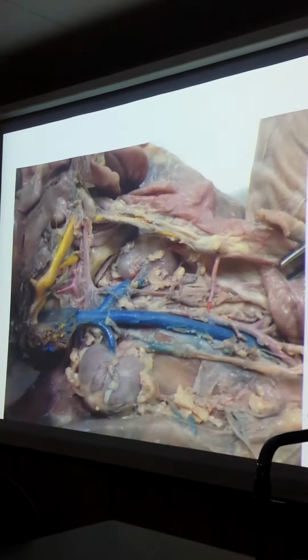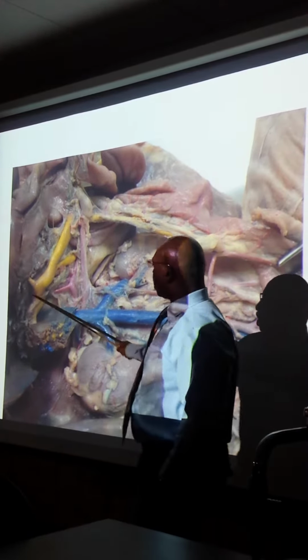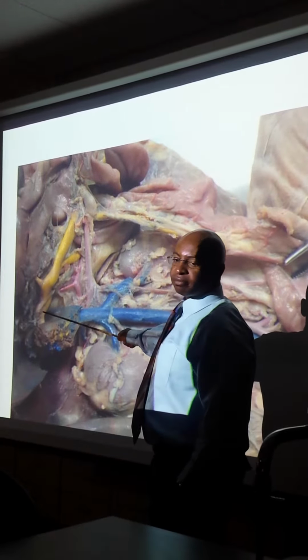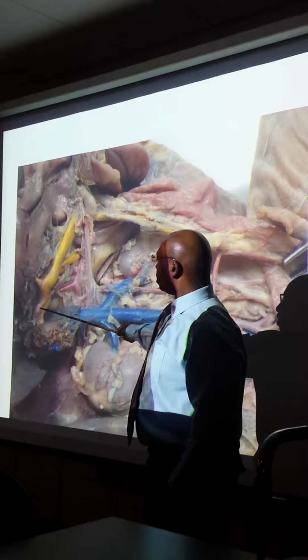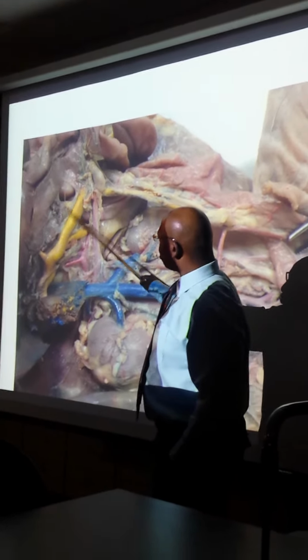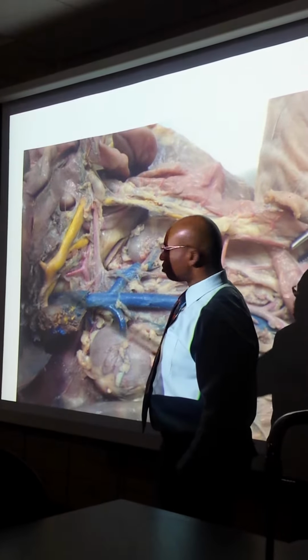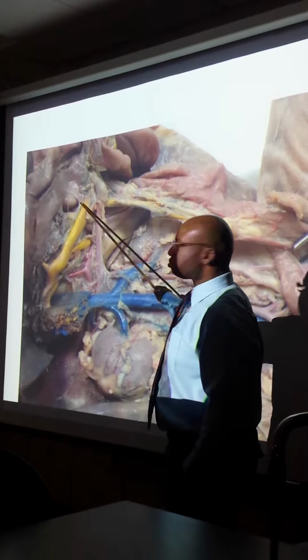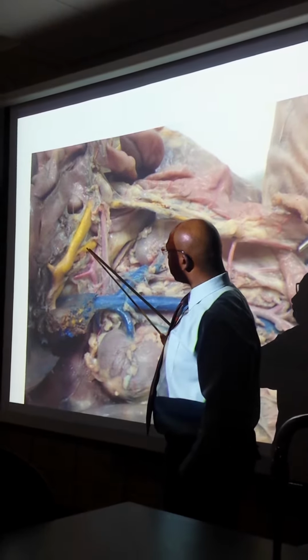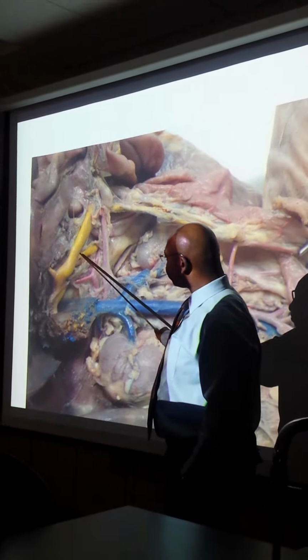I have better pictures. I'm just going through each one, and this one is the best, right? You see what I'm saying? So again, we've got a lot going on here. We get the hepatic portal vein, superior mesenteric vein, and then where's the superior? Right here. This big fat one right here. Okay. And then this is the gastrosplenic. You don't see the spleen, but it's going there. Gastrosplenic, okay? This one right here.